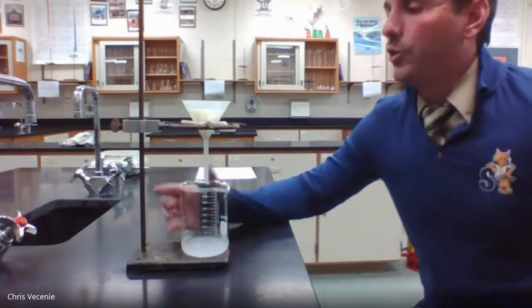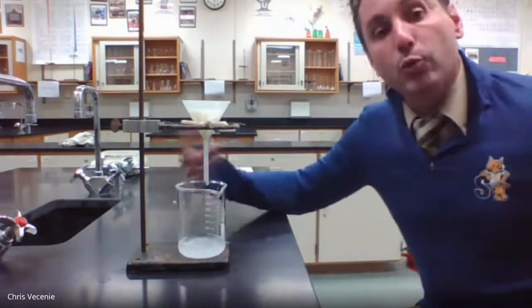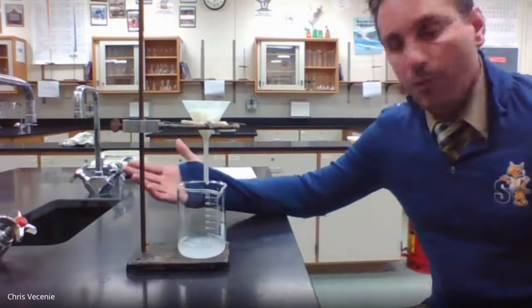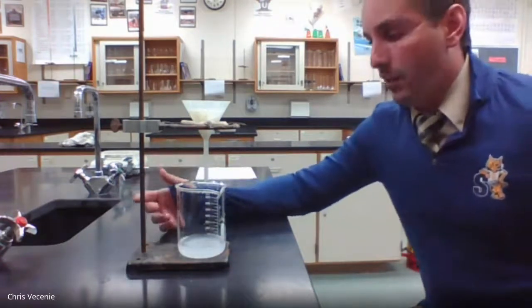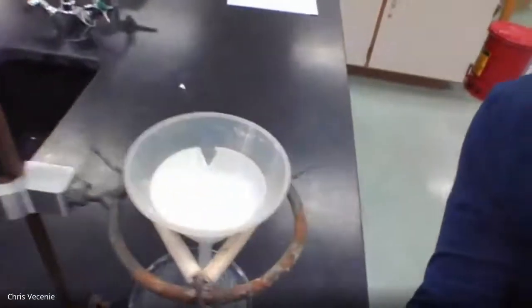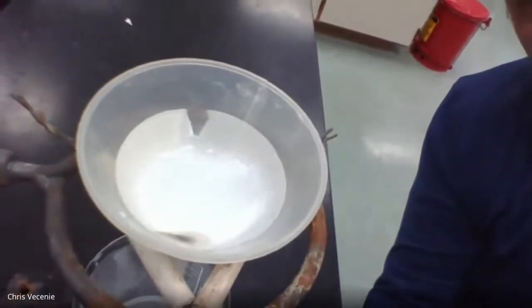So a lot of times what we'll do is we'll take this underneath and pour the filtrate back through to try and refilter it. And these are all the things that we would do in the lab to try to increase your yield of calcium carbonate. But for the purposes of the video, you are getting the idea of what's happening. All right, so we're letting this thing drip. And if I let you look down in there, you can see you're starting to get white solid caught on the filter paper.